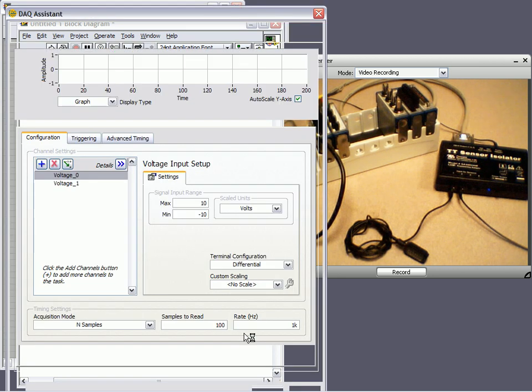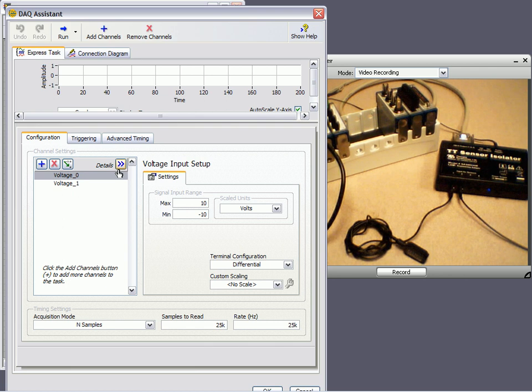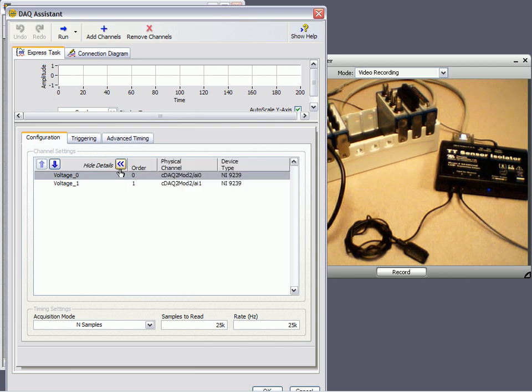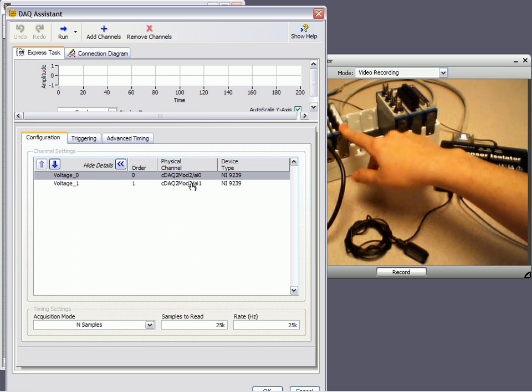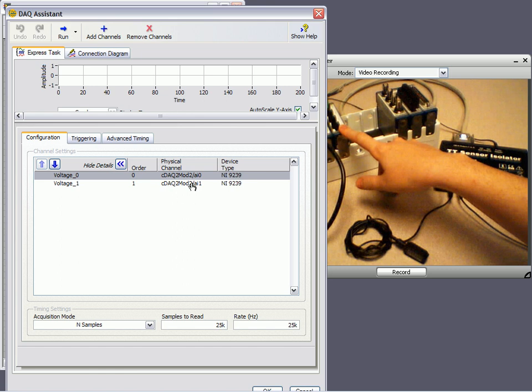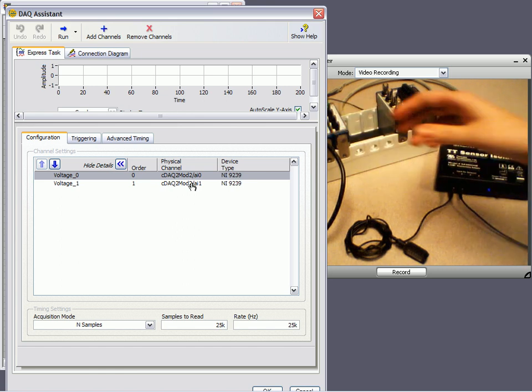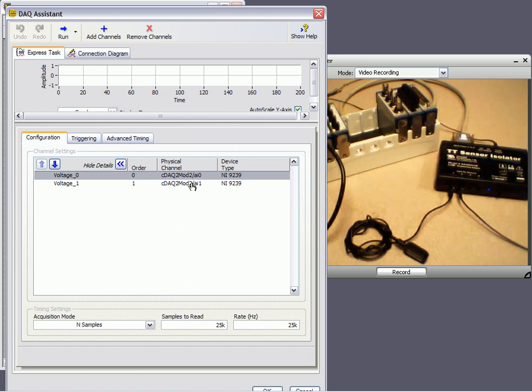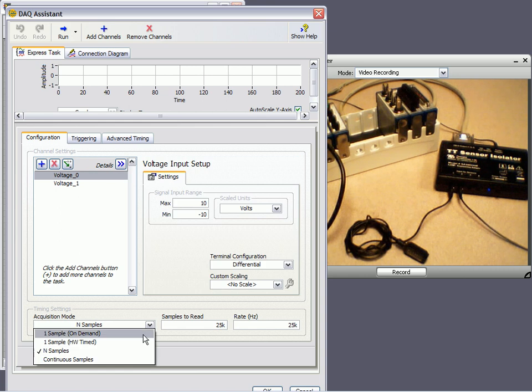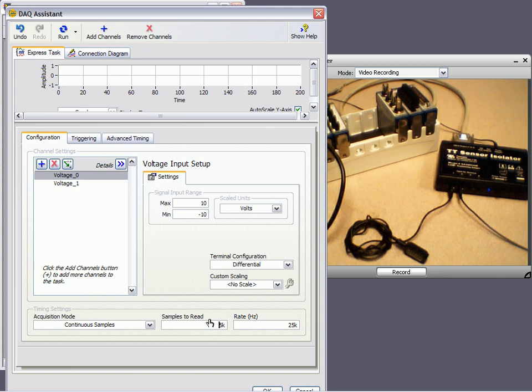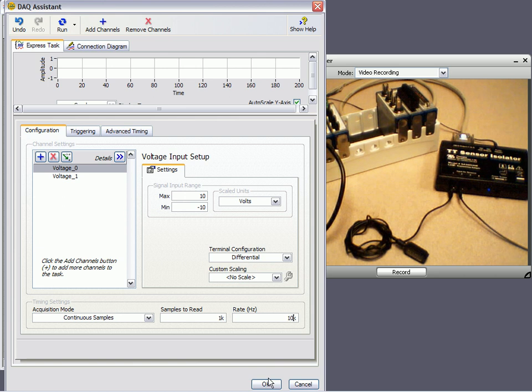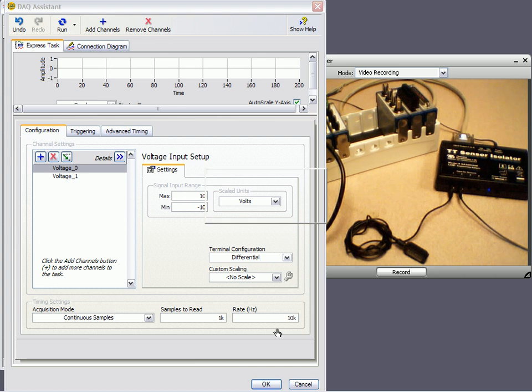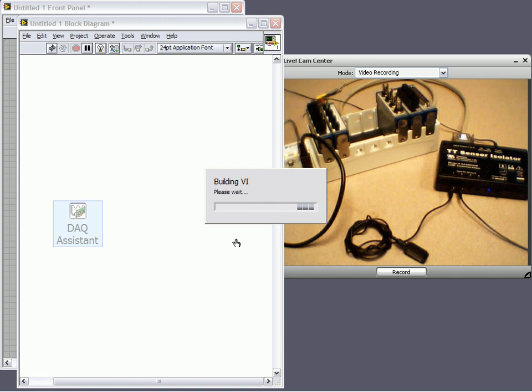The configuration window will appear next, and this is where I can, at a click of a button, configure my task settings. The Details tab will show me that I'm working from Module 2 in my chassis, and I'm acquiring Analog Input 0 and Analog Input 1, which are my first two channels. I can hide these details. Really, the only thing that I need to change here is I'd like to acquire it continuously, and I'd like to read 1,000 samples with every iteration of my while loop, and I'd like to acquire them at a rate of 10k samples. So if I click Alright, it's going to verify that these are correct settings, and then it's going to build the source code behind the scenes for me based off the settings I selected.